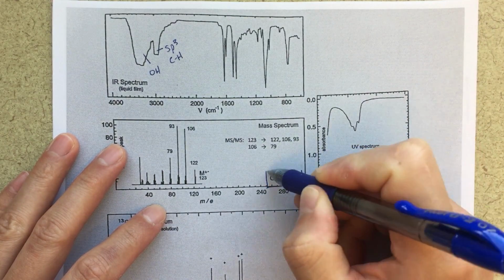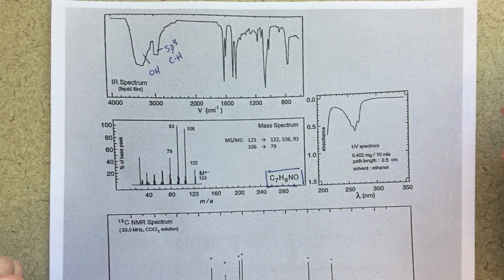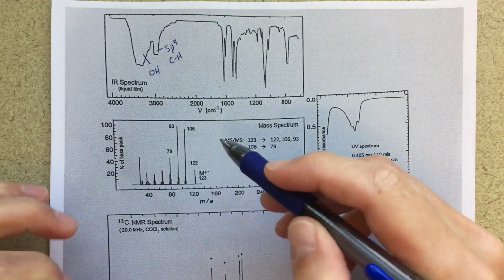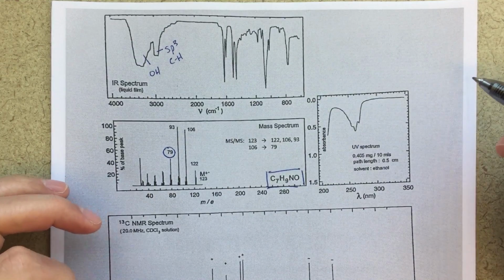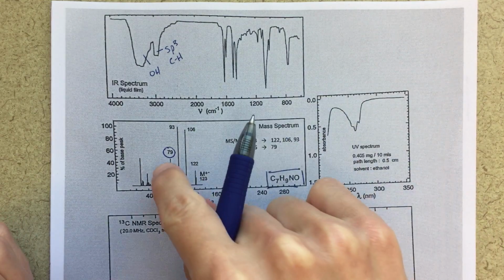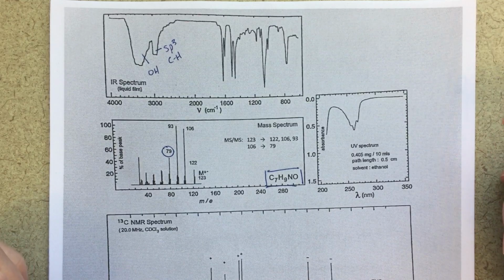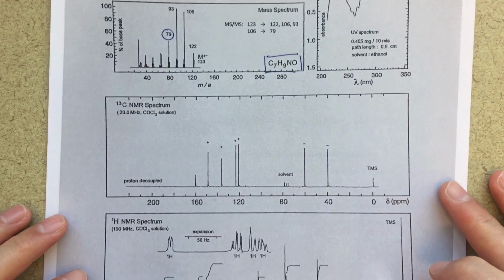Obviously, we know that the chemical formula is C7H9NO because that's given. And from this mass spec, we'll talk more about this, I think that this peak at 79 is a very indicative peak. I think that we can draw some conclusions from that, and I'll talk about that in just a second. But if you're curious why I'm saying that, maybe think about a modified aromatic ring that could match up with that 79. So, a little hint of what's to come.